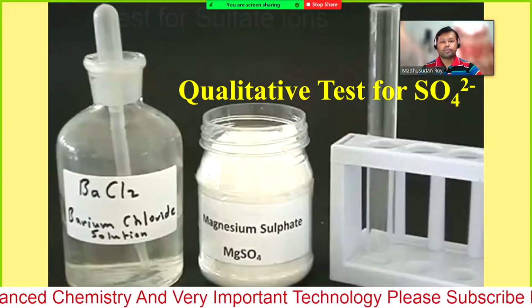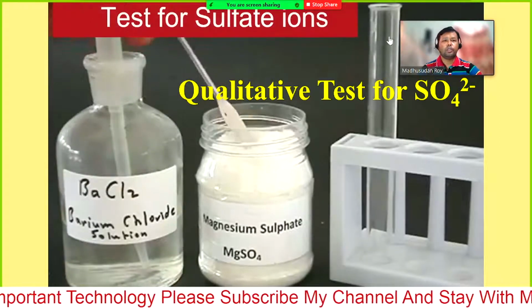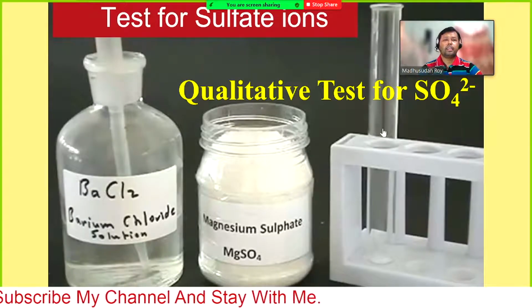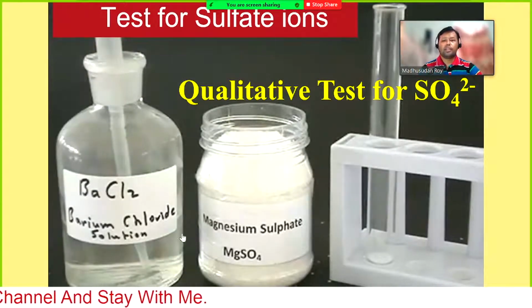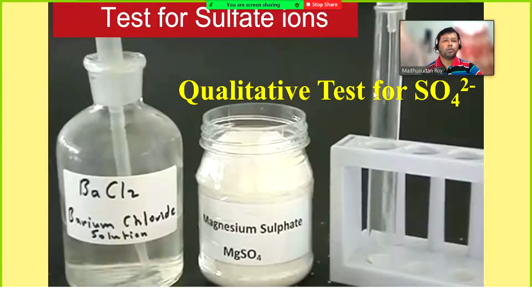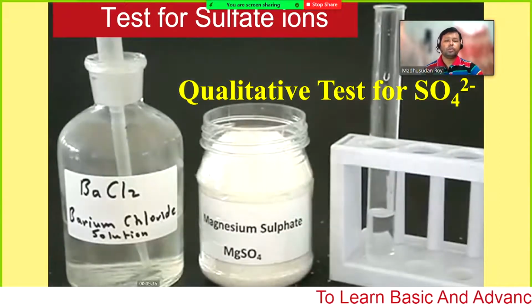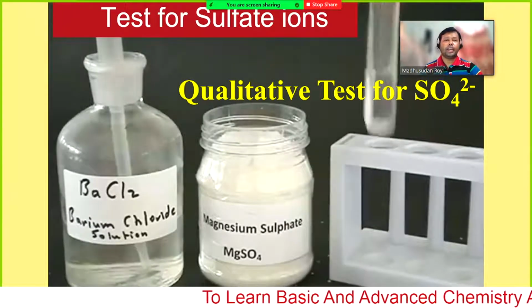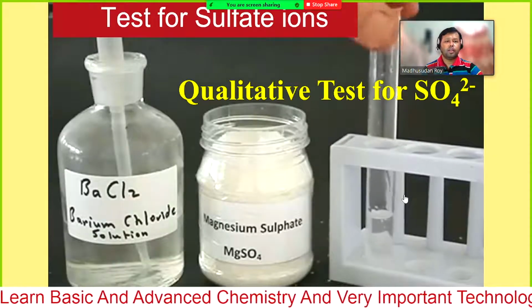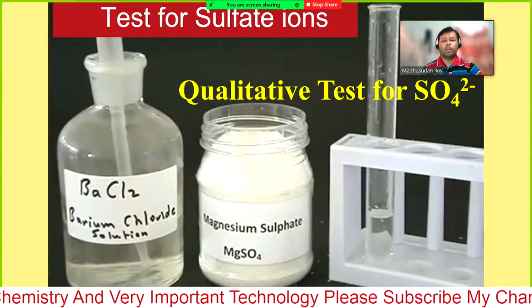So let's see. This magnesium sulfate, this salt, is taken into a test tube. Here you can see it is taken into the test tube. Then dissolve it in water, add some distilled water. Now taking the distilled water. Okay, enough. Then take the test tube and shake it very well to dissolve it.